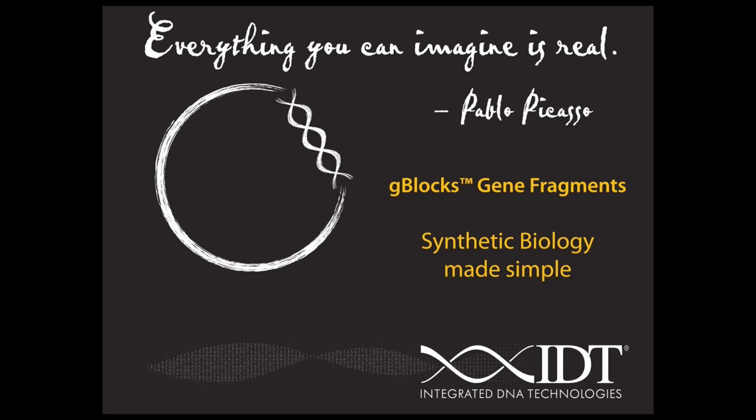Okay, here's actually the last question I have on the list right now: can I use the Gibson assembly method to assemble a highly repetitive sequence? And then they say they wanted to synthesize a construct in which 40 base pairs are exactly the same as the last 40 base pairs. So it looks like it's a 40 base pair thing that repeats. Okay. The answer to that, I would say, is maybe.